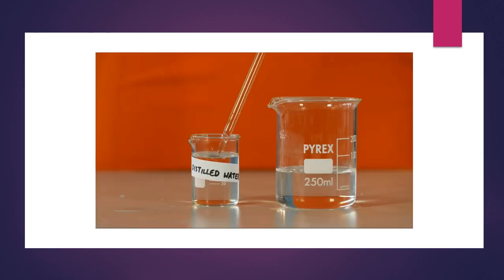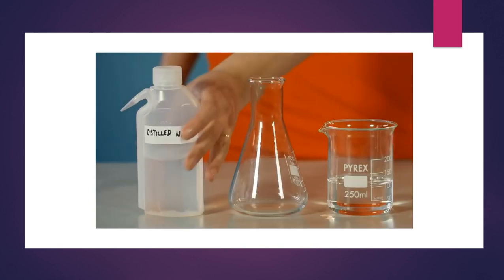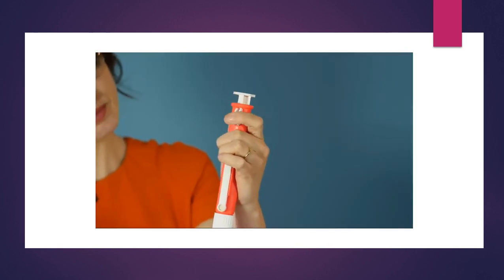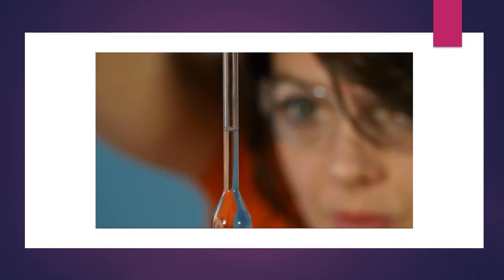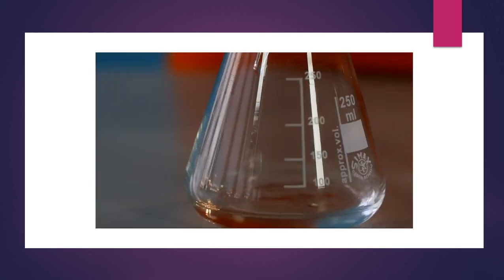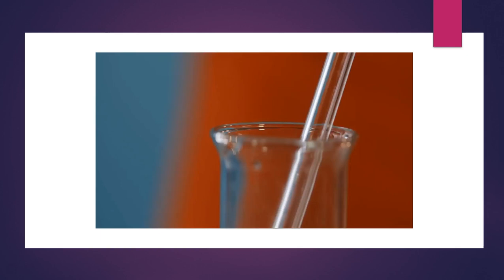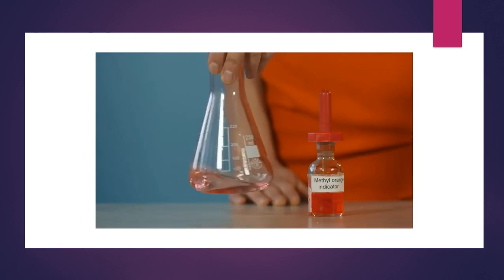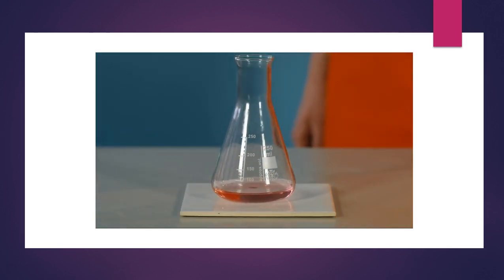Rinse the pipette with some distilled water and then two or three times with some of the dilute hydrochloric acid solution. Rinse the conical flask with distilled water only. Using the pipette and pipette filler, transfer exactly 25 cm³ of the hydrochloric acid solution into the clean conical flask. Allow the pipette to drain for several seconds after it's been emptied, then touch the tip against the side of the flask. Do not force the last drop from the tip of the pipette. Add two to three drops of methyl orange indicator to the flask and take note of the colour of the solution, placing a white tile underneath the conical flask to make the colour more obvious.